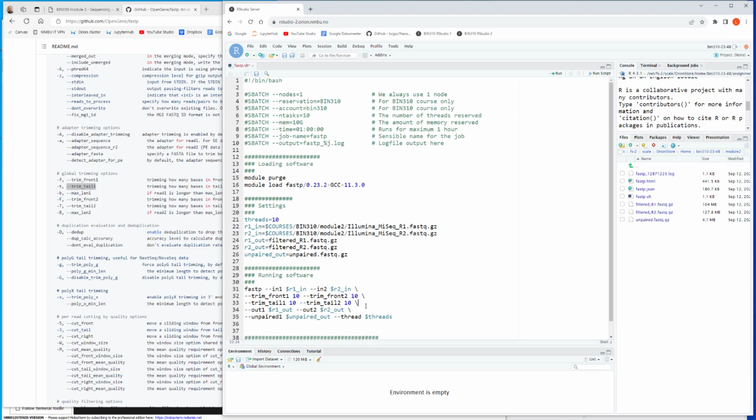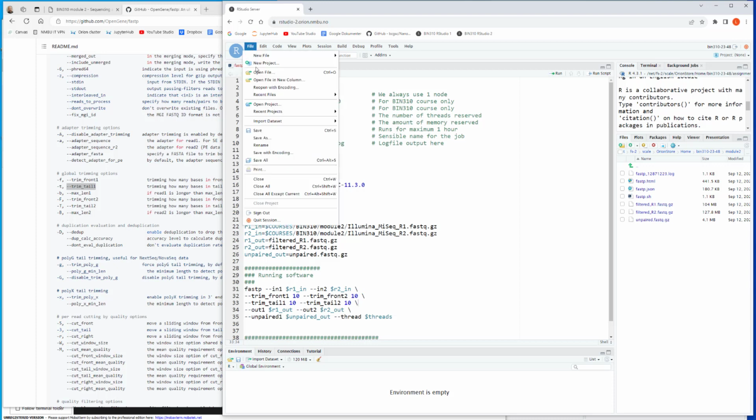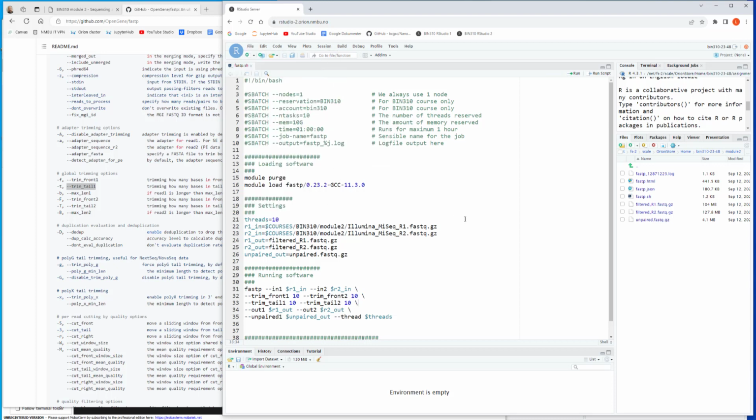But then you will have an error, because then the command line sort of ends here, right? And it will complain that you don't specify the out, I suppose. I don't know, but you can try, if you like, to forget one of these and run it and see what happens. Let's not forget it and see what happens. First, of course, you have to save all your changes, so it's no longer red up here.